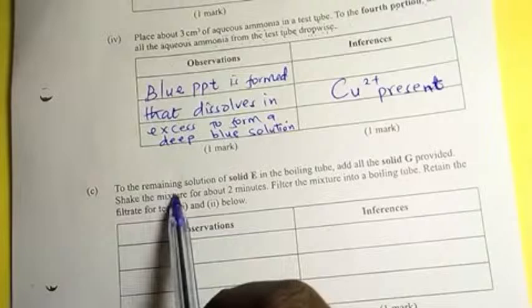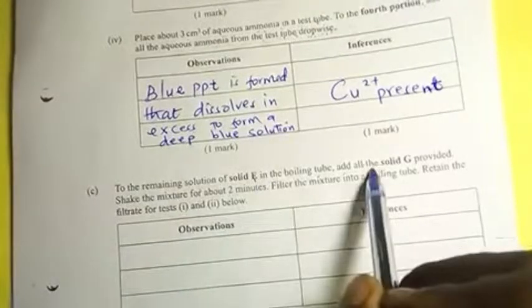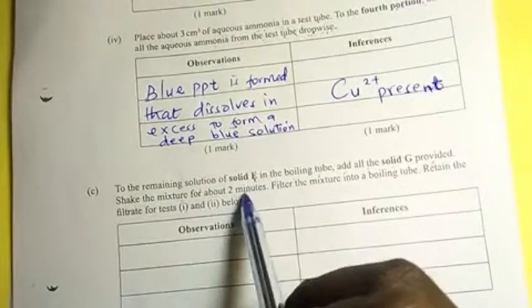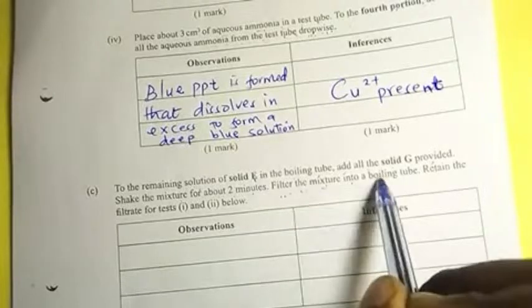To the remaining solution in the boiling tube, add all solid G provided. Shake the mixture for about 2 minutes, after which, filter the mixture into a boiling tube. Retain the filtrate for tests 1 and 2.